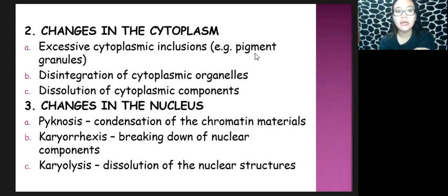Another change in the cytoplasm is the disintegration of your cytoplasmic organelles. Of course, since the presence of these cells is brought about by an abnormal proliferation, the different organelles are more susceptible to damage or disintegration.